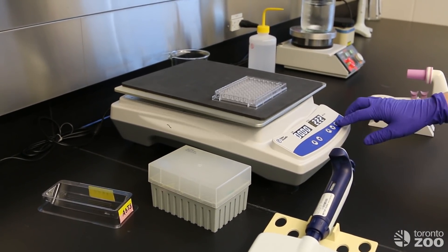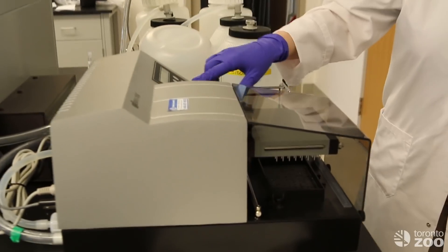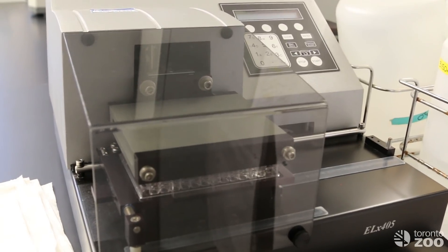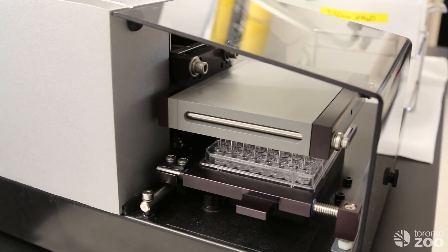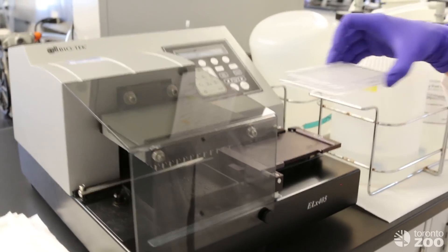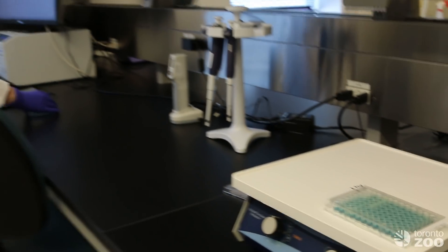Once it was finished we would then have to wash the plate for the colour development to happen. We then add substrate for the colour development. I'm going to show you a couple of finished plates — this is what they look like when they're done — and then we would take them and read them in the spectrophotometer.